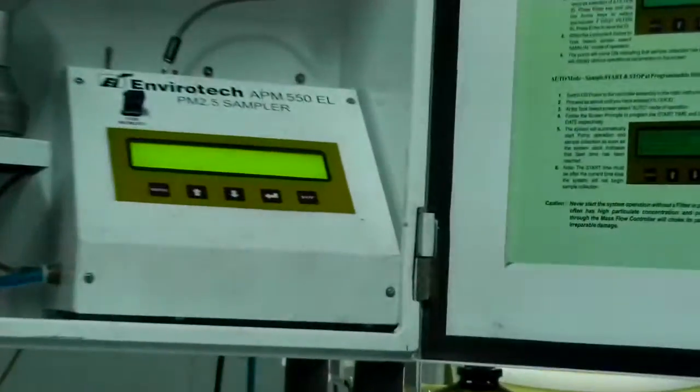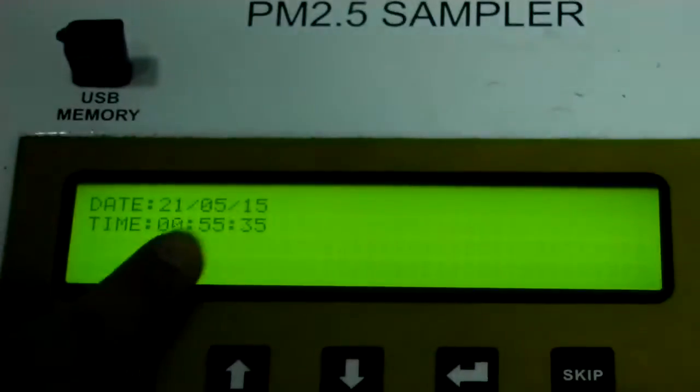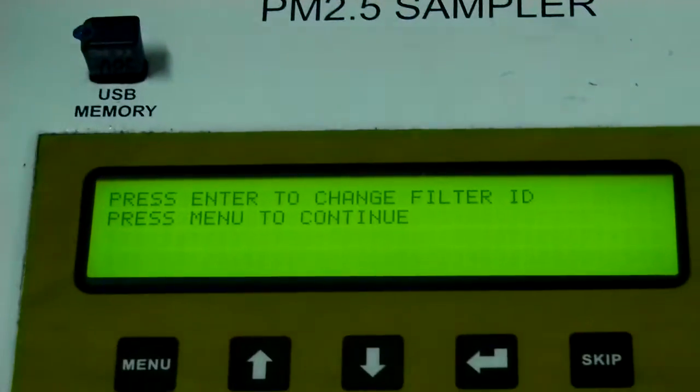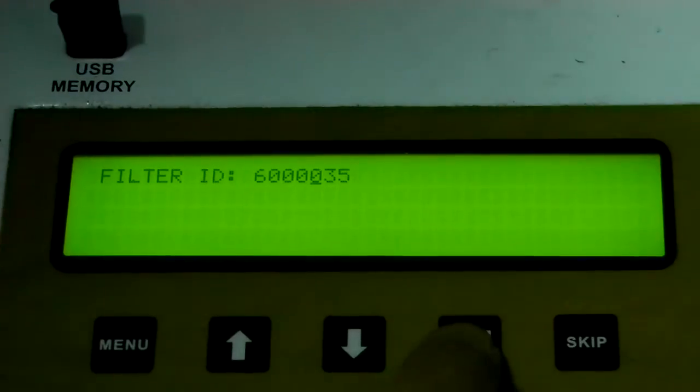Once we have connected everything, we can switch on the power. Now it's started. We have to connect the temperature sensor. There is a timer — today is 21st May 2015 — and we need to fix the time. We can change the filter ID by pressing Enter; right now it's 35.